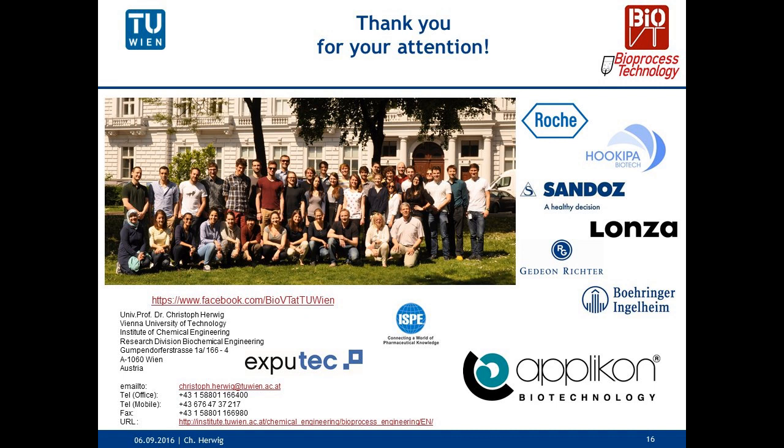So our first question is, you mainly showed data on microbial processes. Can this be equivalently transferred to mammalian processes? Yes, in fact, that can be done. Of course, mammalian processes are more complex. We have to think about different measurements, which are generally necessary to do so. But this work can be done.